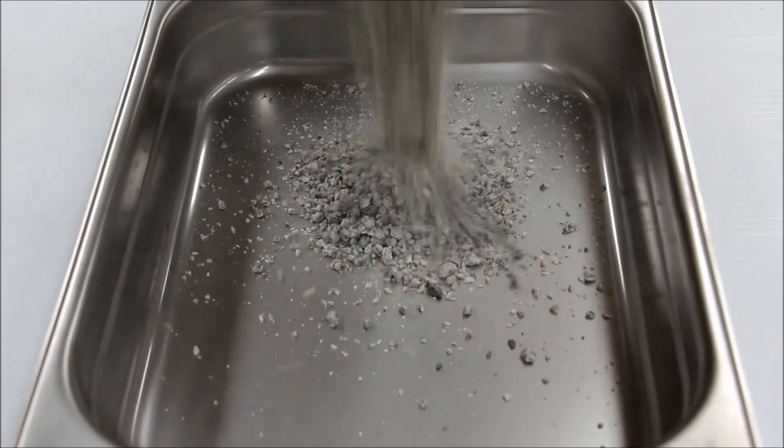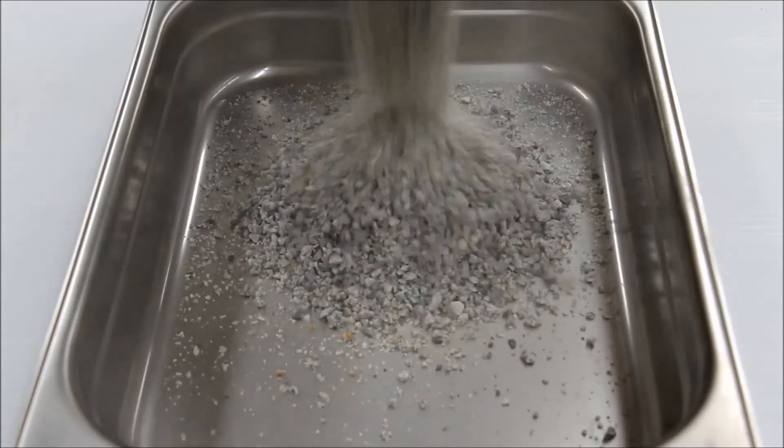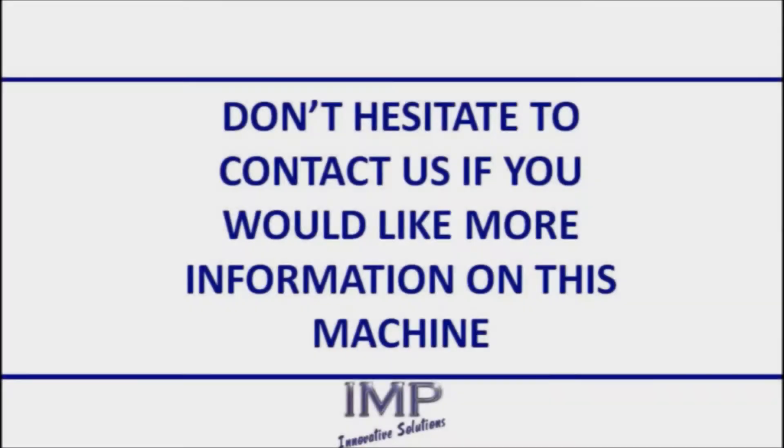Shown here is a typical sample that has been crushed by the CM20. For more information about this machine and how it can benefit your business, please do not hesitate to contact us.